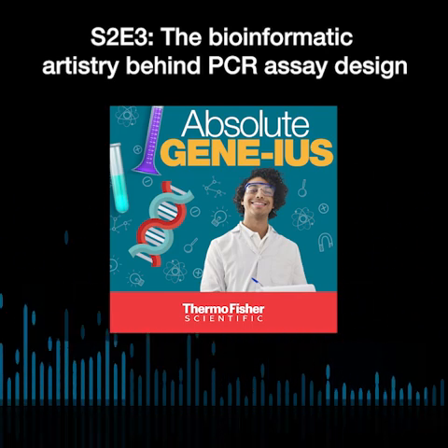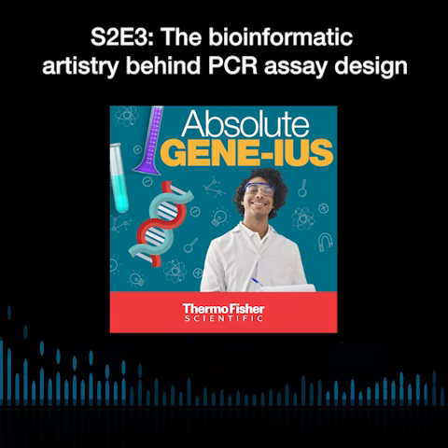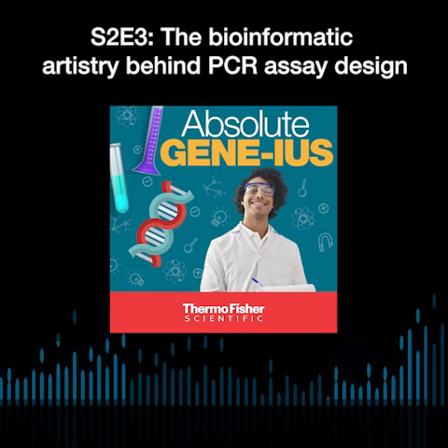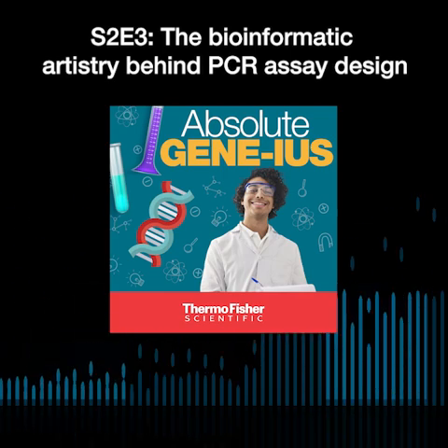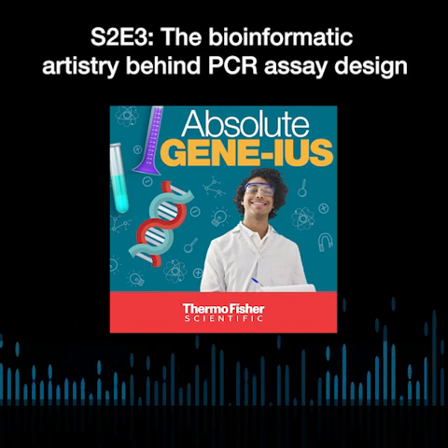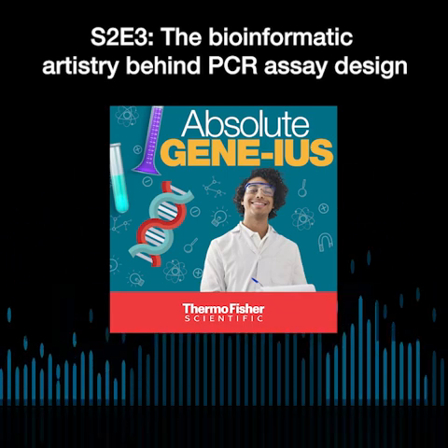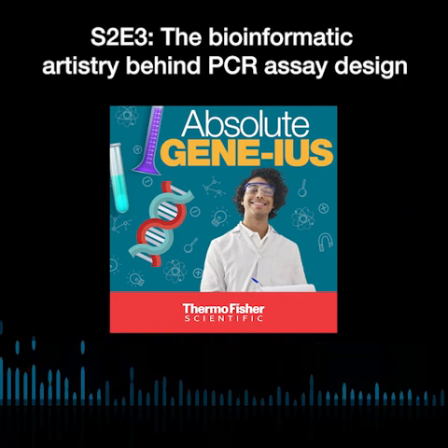And so a lot of times, you might have to play with the extension temperatures. You might have to play with the extension time, different parts of the PCR thermocycling conditions, because on the bioinformatics end, the assay design warrants a longer extension time and or a lower extension temperature or something. Yeah, because we do predict sometimes that we would like a specific probe to sit before another probe. And so for playing around with all those factors, we do work closely with our molecular biologists.